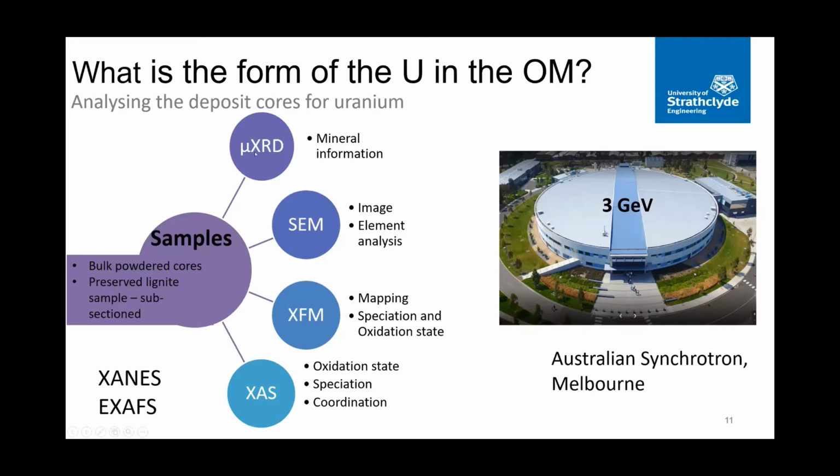So the techniques employed were laboratory micro-XRD with a GADDS system. We had SEM, and then going to the synchrotron X-ray fluorescence microscopy, so that's a mapping technique, with also speciation capabilities, and of course standard XAS for oxidation states, speciation, and coordination.